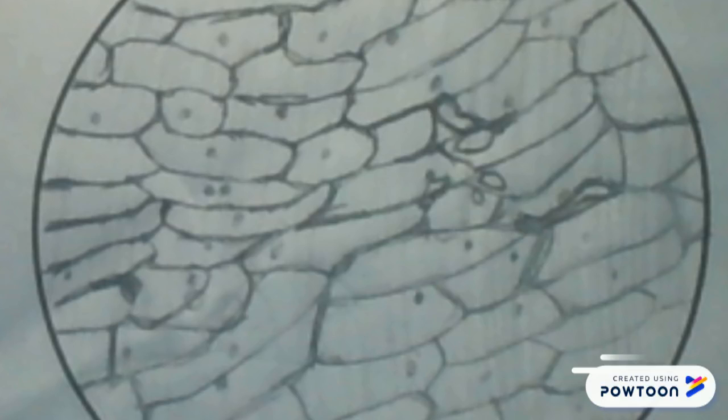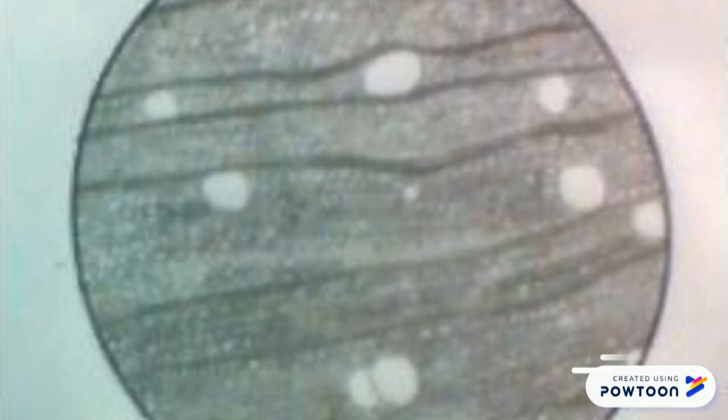The next one is an onion peel at medium magnification. The students found that the onion peel had a brick-like pattern and also many small vein-like lines blended in the image. Students also made an observation that the small dots in the spaces were the nuclei of the cells. When students observed plywood, they saw that there were multiple circles that were separated by thick lines. They also observed how there were a few bigger circles that stood out and lighter circles that looked like bubbles.